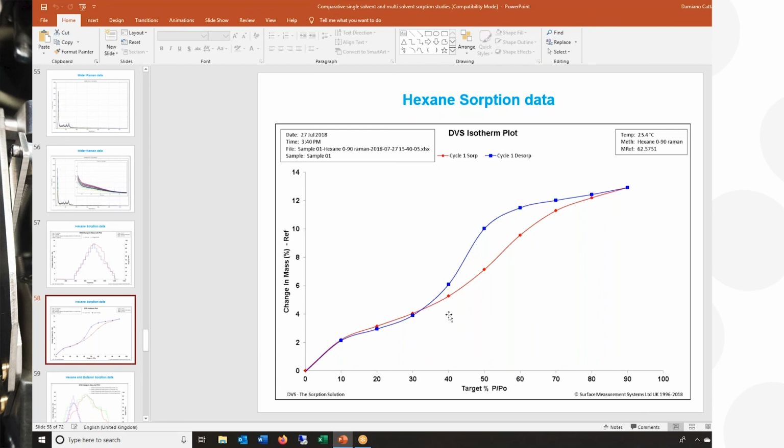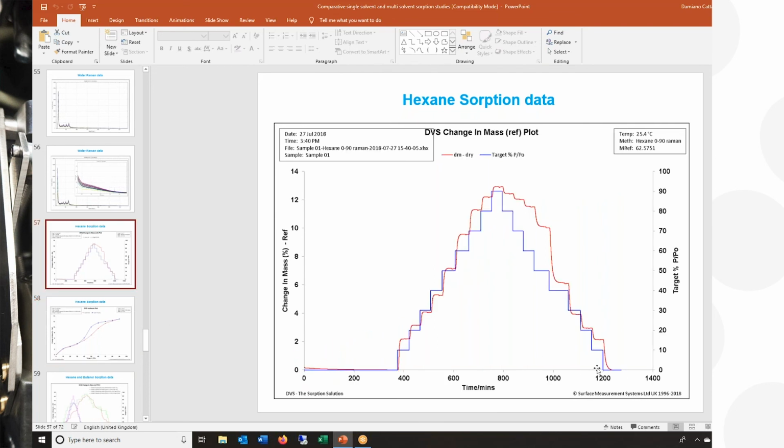If you think about, for example, a recrystallization stage, a glass transition, or decomposition, you can see examples in which the desorption line is lower than the absorption line. And in that case, it won't be reversible, which means that they don't go back to the initial value, but will go much lower than that. And that causes the transition, the shift.